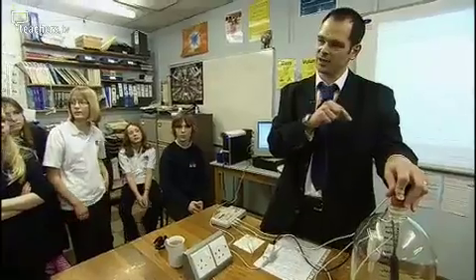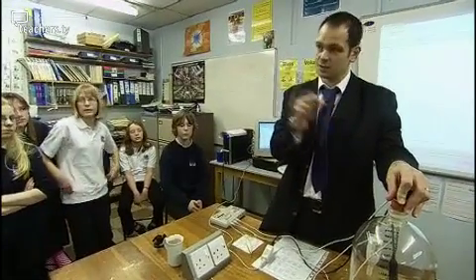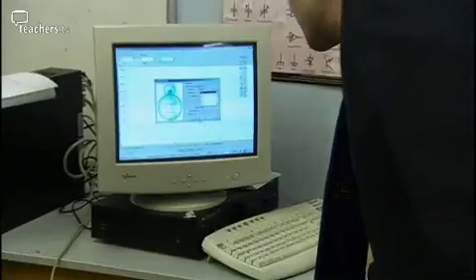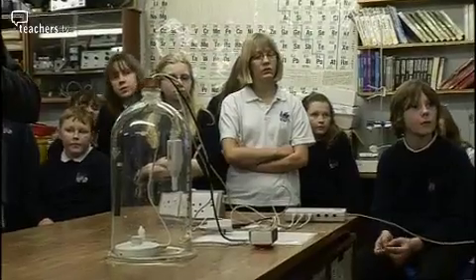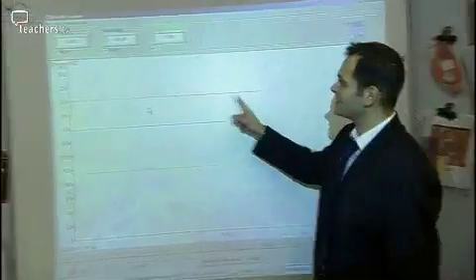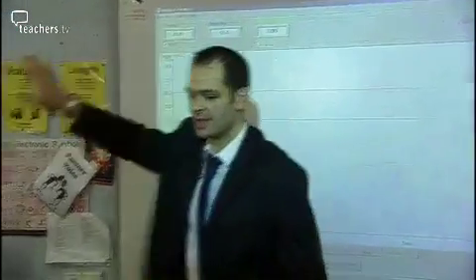Well done, Zach. Okay. So at what level, in terms of percentage, we start at 21%, do you think the candle will go out? 15. Okay, that's a good guess. I like that. Okay, here we go. I'm going to start it plain. So our carbon dioxide is not changing, our water is not changing, and neither is our oxygen. Okay, staying the same. So I'm going to put the candle in.